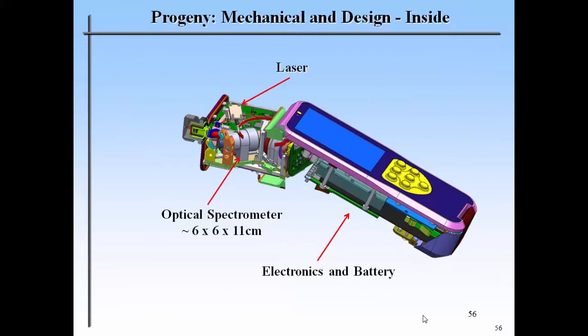This instrument is a very new one, and you see again, the weight comes from the batteries mostly. This is the optical heart where you have the laser. Here you have your sample, and then it comes back, falls on this specific grating before it goes to the detector.